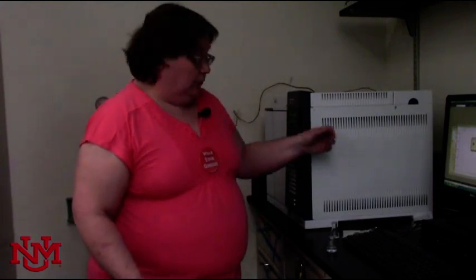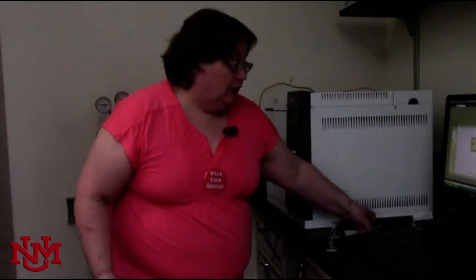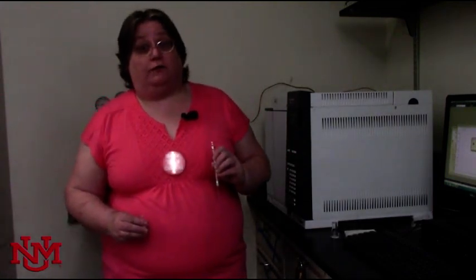While it is equilibrating, you need to clean the syringe. Never trust a syringe you haven't cleaned yourself. That leads to bad peaks, false data and ultimately a really awkward conversation with your boss about how you've just lost three months worth of work because you isolated the wrong compound.